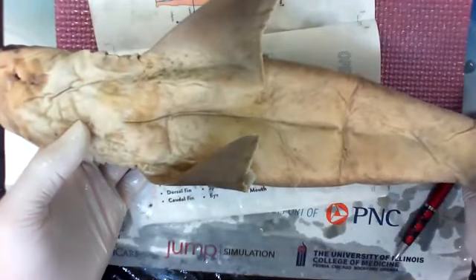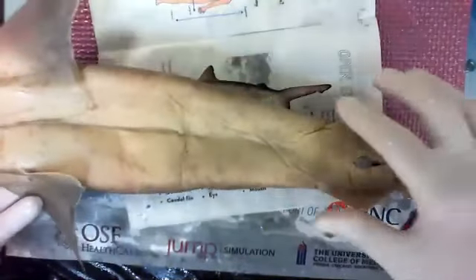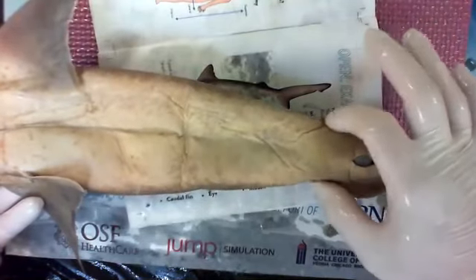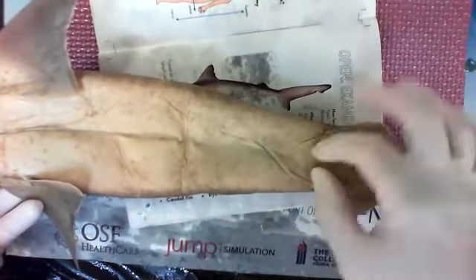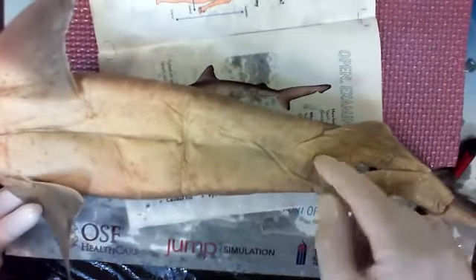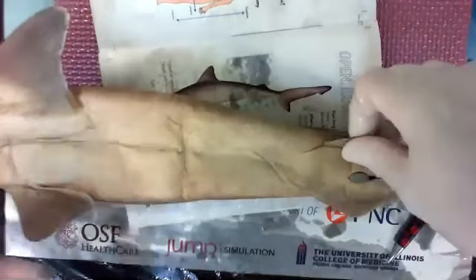Thinking back at parts of the body, pelvis. Your pelvis is your hip region, right? So if these are the arms, and this is the pectoral region, go down, down, there they are. And you can feel this is like where the leg would connect to the hips. You can feel right across here, there's a strap, like the front of your hips. You have your pubic bones, and the pubic symphysis is a little piece of cartilage on a human right here. Same way, here's where the legs would be. So pelvic fins are the ones going off the hips.